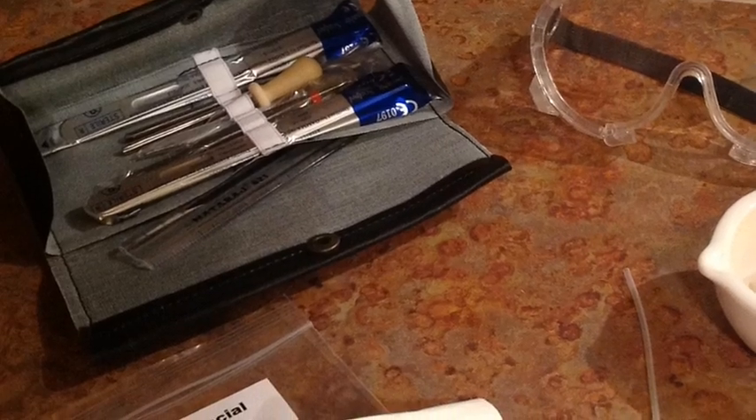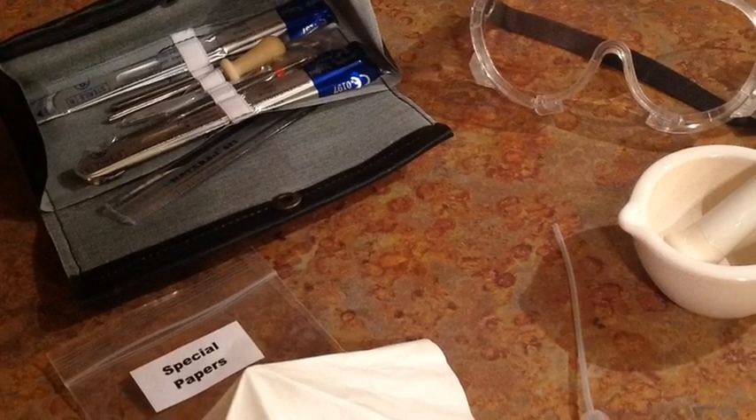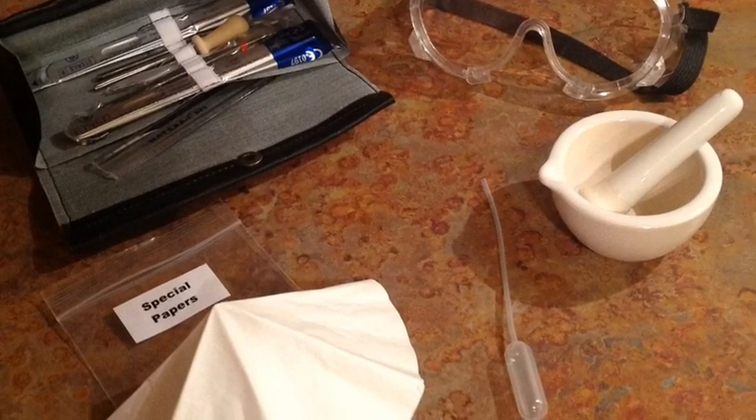The dissection kit, the safety goggles, the ceramic mortar and pestle, and look for the plastic bag that says Special Papers — that's where you'll find the filter paper.